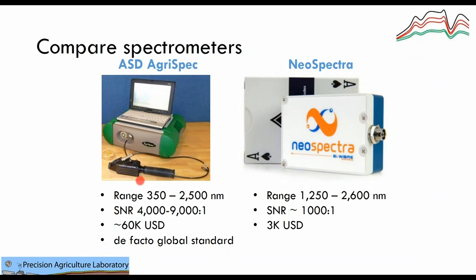All right, so that was on mid-infrared spectroscopy, and we have now some of the studies that we're doing at Sydney Uni, in the Precision Agriculture Laboratory. This is a study made by Dr. Edward Jones. He is working in the laboratory as well.